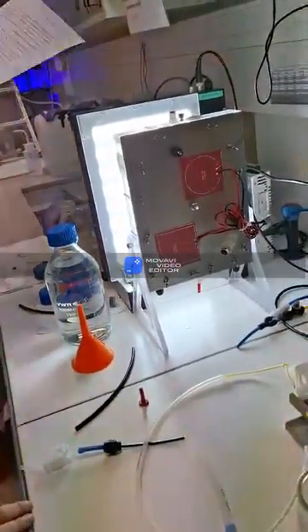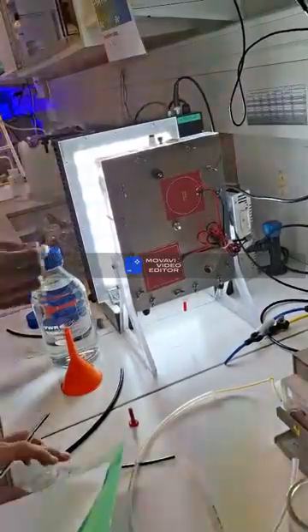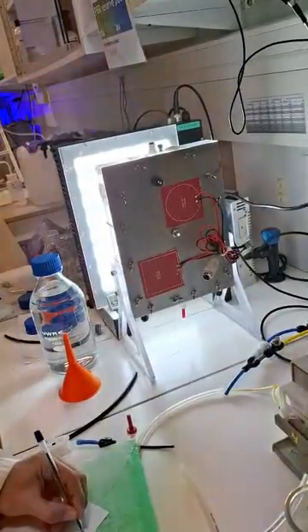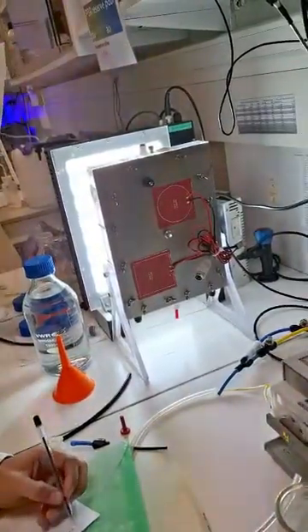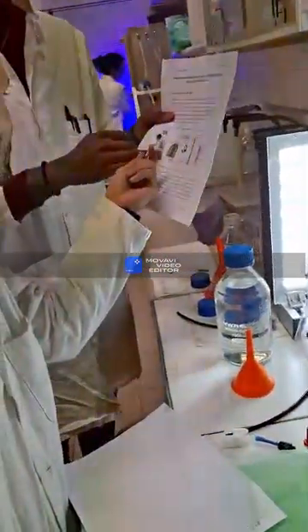And why don't you have a flow meter? Because it's not a perfect system, just for training. You have some valves here to regulate the flow rate. And here you have a little view of the PBR. So here you will have a convection thanks to the air injections.